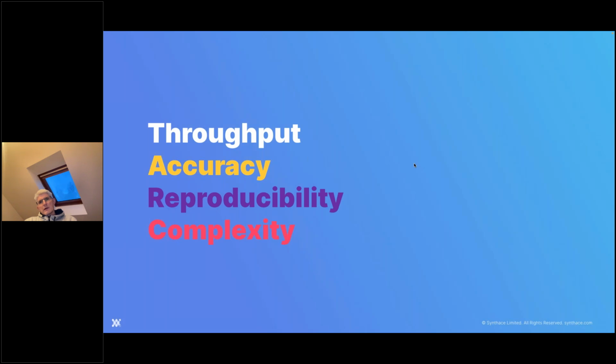So any experiment where you're running a large number of runs, where every single one of those runs is varying over however many factors you've chosen. And we've internally run anything up to 27 factors simultaneously, and our clients have run up into the 20s as well. And so you can imagine, say, running a 300 run design where every single one of those runs varies over 20 different factors. That's got an absolutely massive level of complexity to deal with, which frankly is just very difficult for a human being to design, plan, and then execute on in the lab. So this is one of the fundamental things that we're trying to address when we're looking at automated experiments.